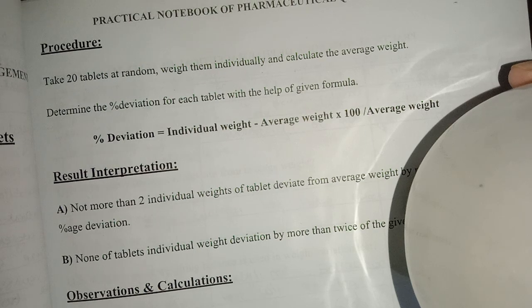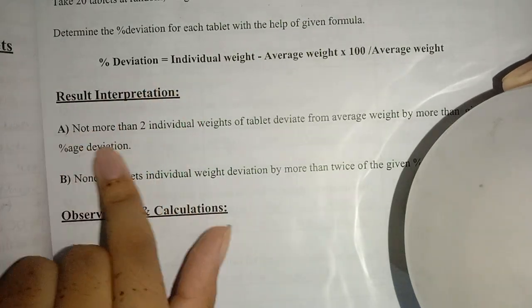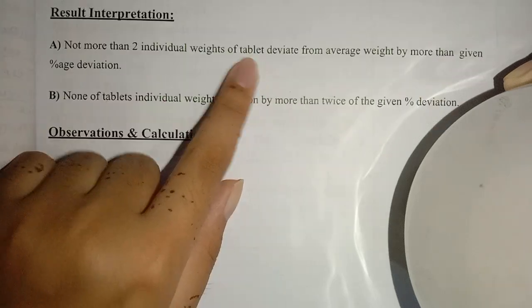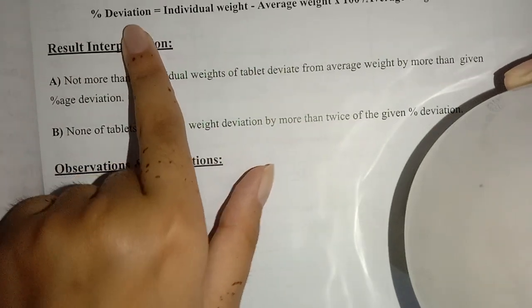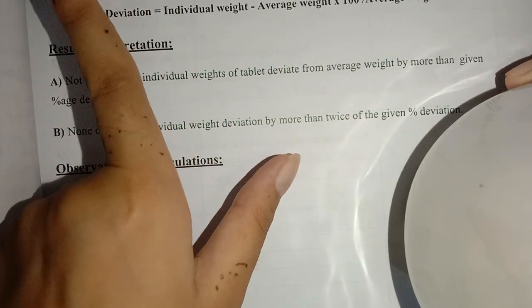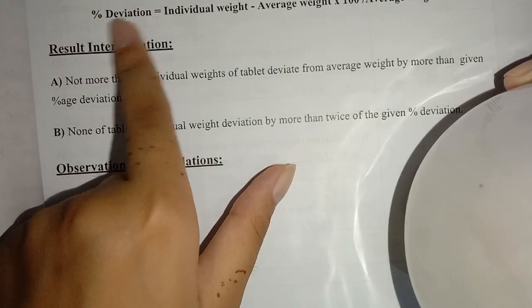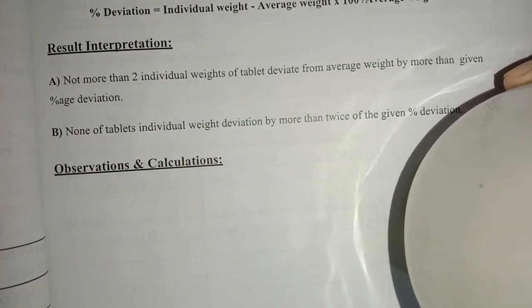Then you will find the average weight. Now result interpretation: not more than two individual weights from 20 tablets should deviate from the average weight by more than the given percentage deviation. You have to find deviation from all 20 tablets.